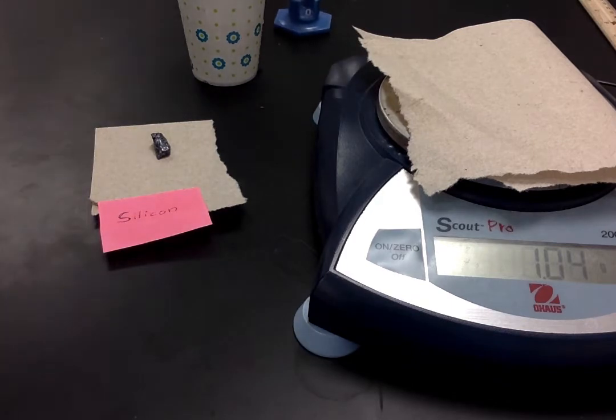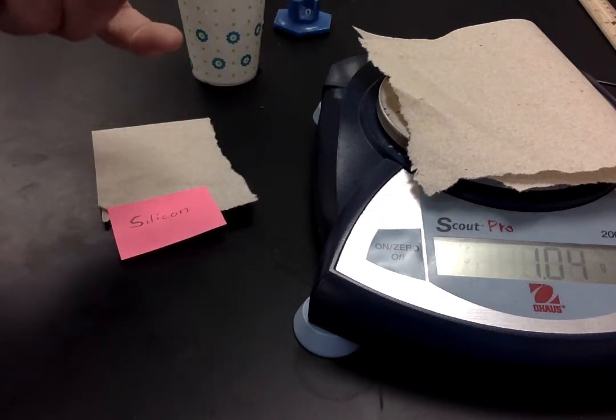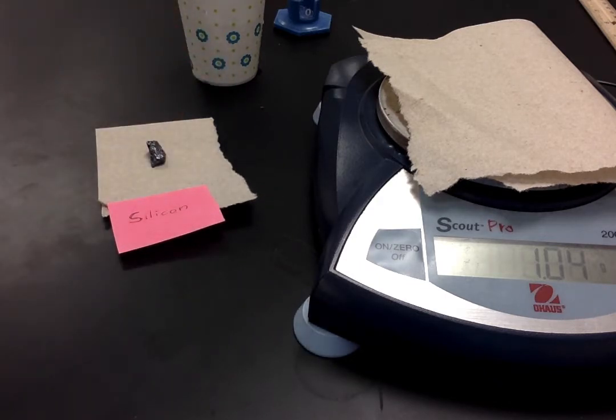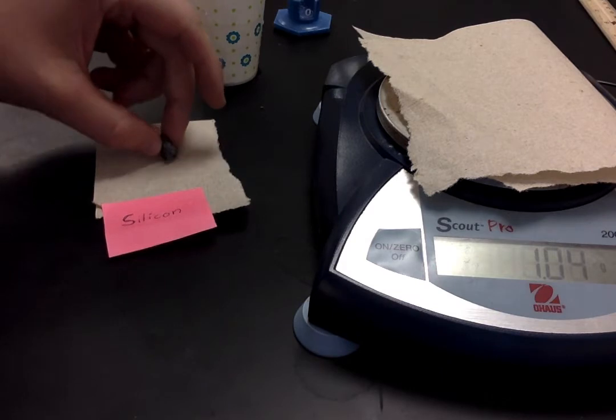First thing I want to try to do is determine the mass of that silicon. And so right now you see I've got a paper towel on there because you don't want to set this silicon just on the scale. It's never a good idea to do that with chemicals. You always want them in some sort of boat or paper towel or some sort of container to keep the element directly off the scale.